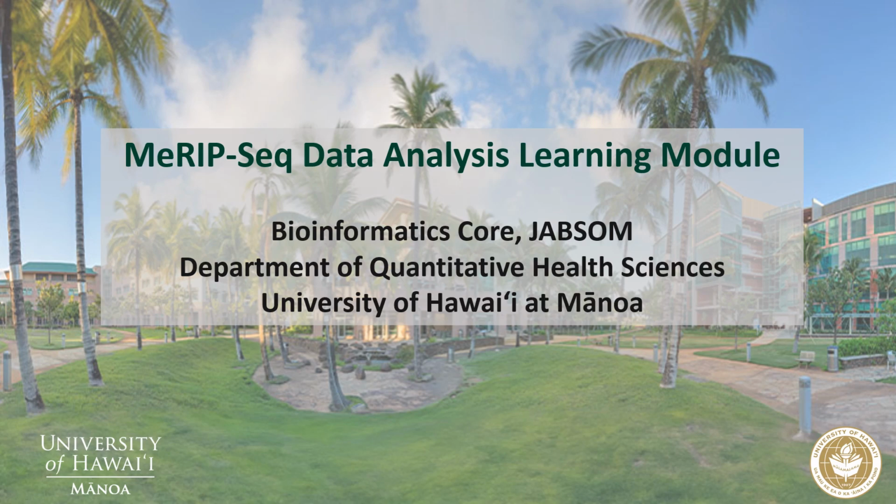Data analysis. Welcome to this introduction to the MeRIP-seq learning module. This module was developed by the Bioinformatics Core at the University of Hawaii at Manoa within the Department of Quantitative Health Sciences. It is a cloud-based, hands-on resource designed to guide users through the analysis of RNA methylation, specifically M6A, using MeRIP-seq data. This workflow emphasizes reproducibility and accessibility, supporting both beginners and intermediate users in bioinformatics.